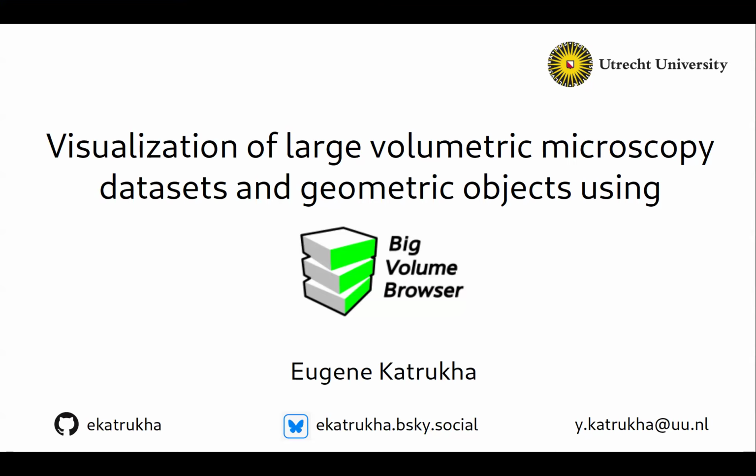This presentation is in the data shared folder, so you can always access it later. Don't get stressed about anything. The main idea is just that you get what it can do and what the interface looks like. And then later we're going to try all the things. I'm going to be going relatively fast with a lot of info, but the main idea is just that you get what the thing can do.